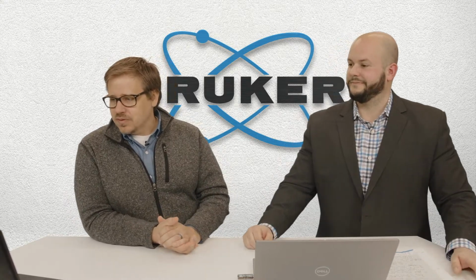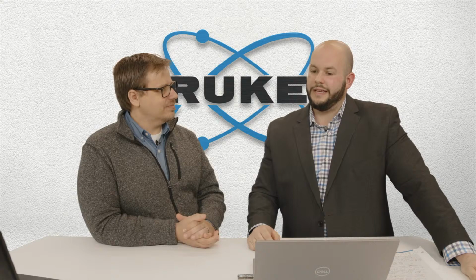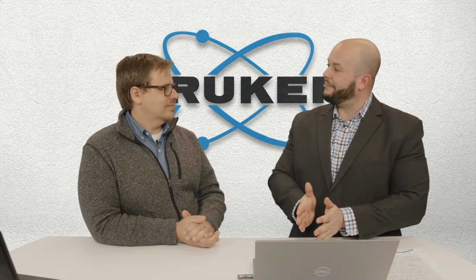Now a question from Jidong. Is this setup also good for GISAXS? Are you referring to the experimental setup? I think so. Probably would want an Eiger for that, because with GISAXS, I believe you're sampling in equatorial and axial directions. You're having a more narrowly defined beam, right?